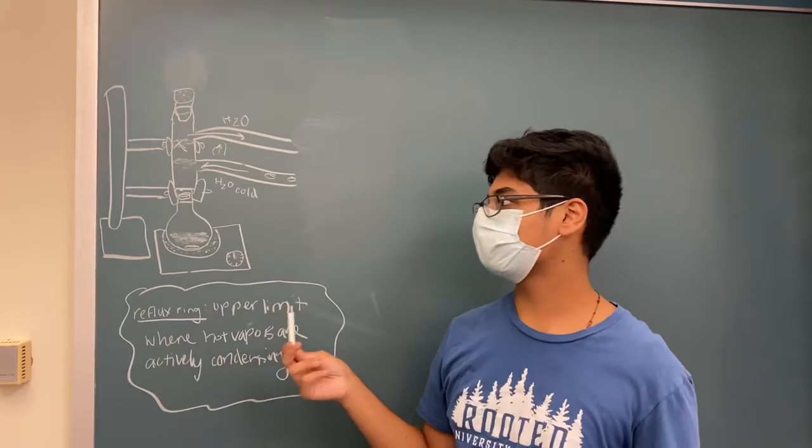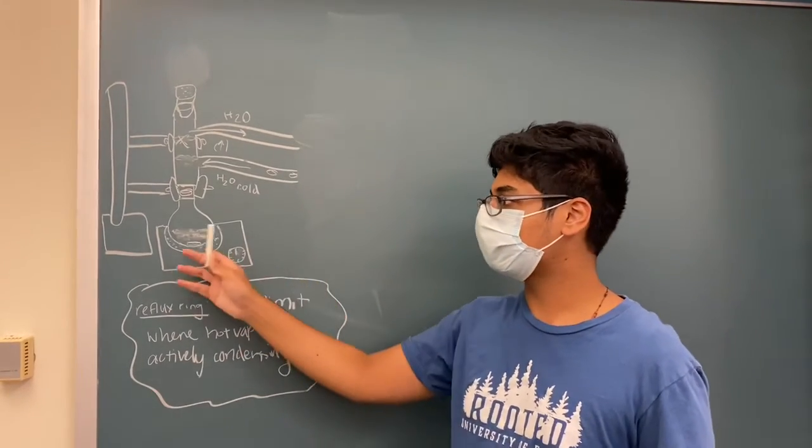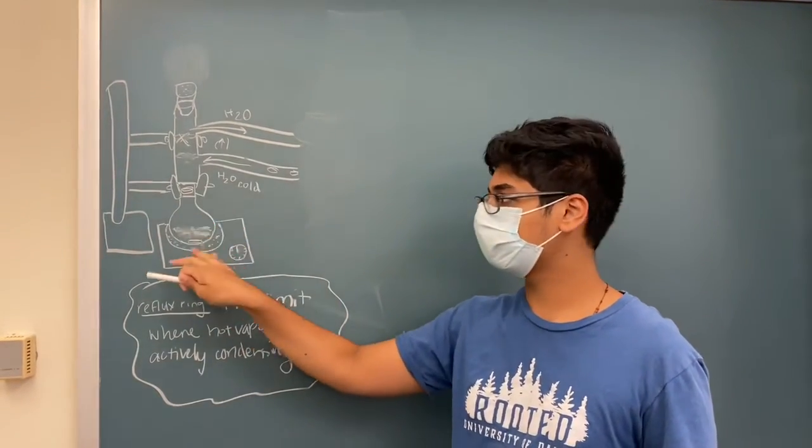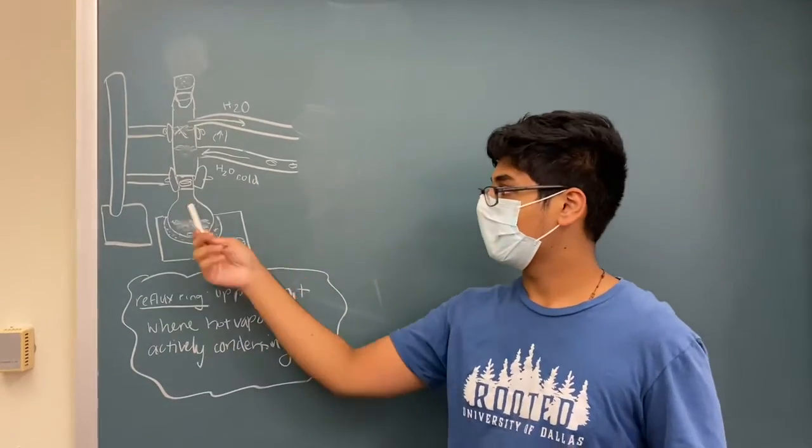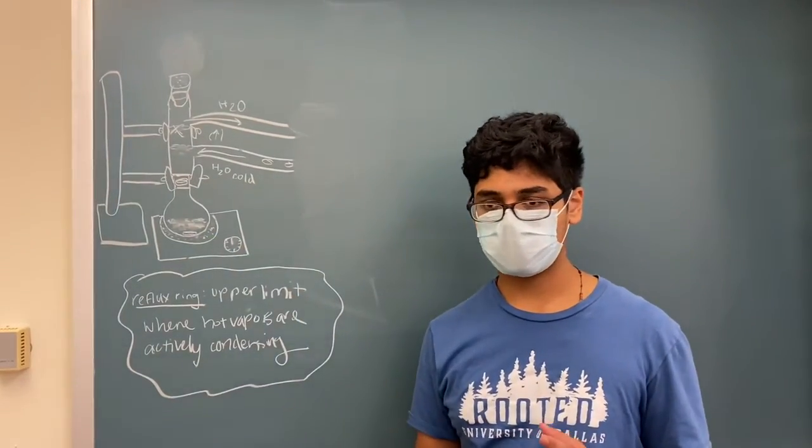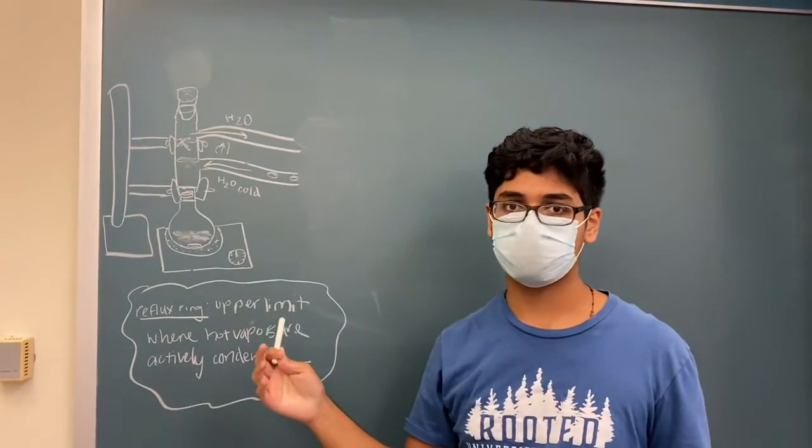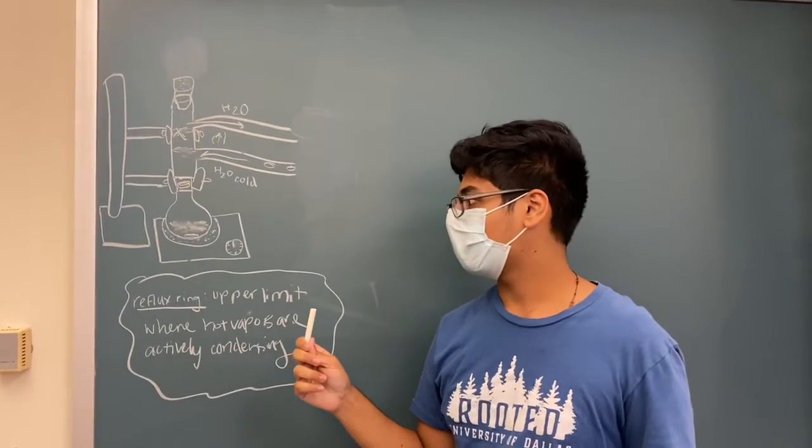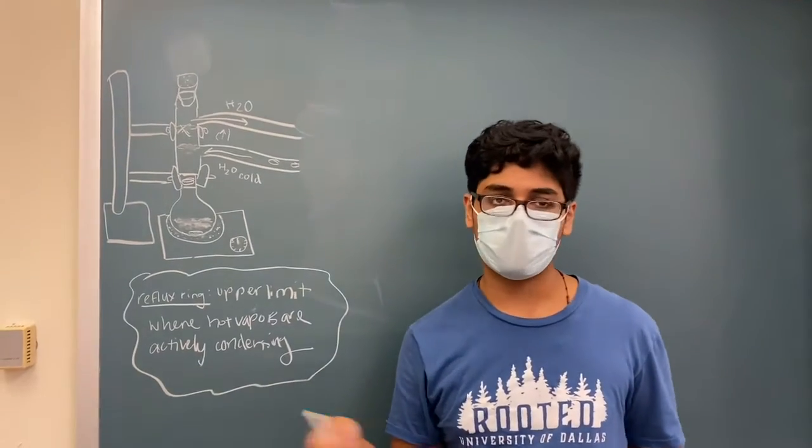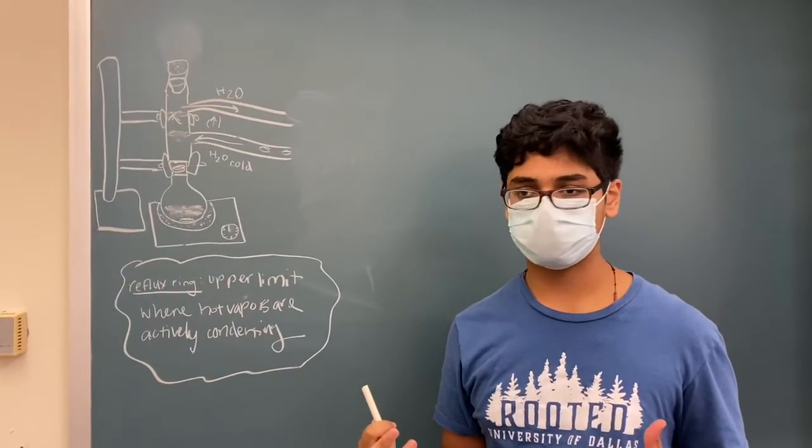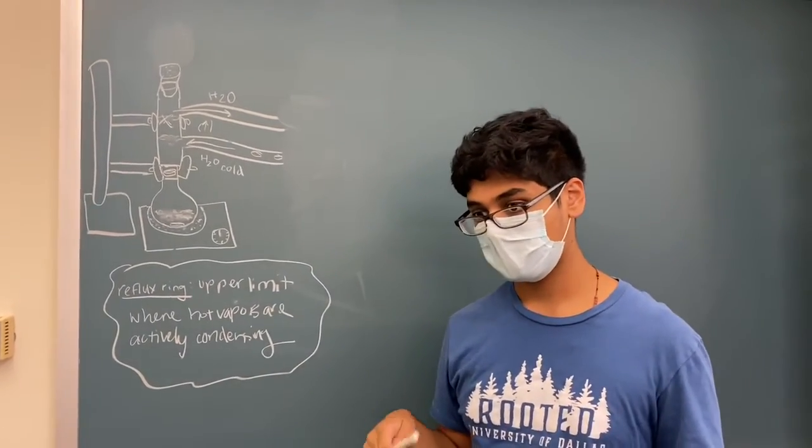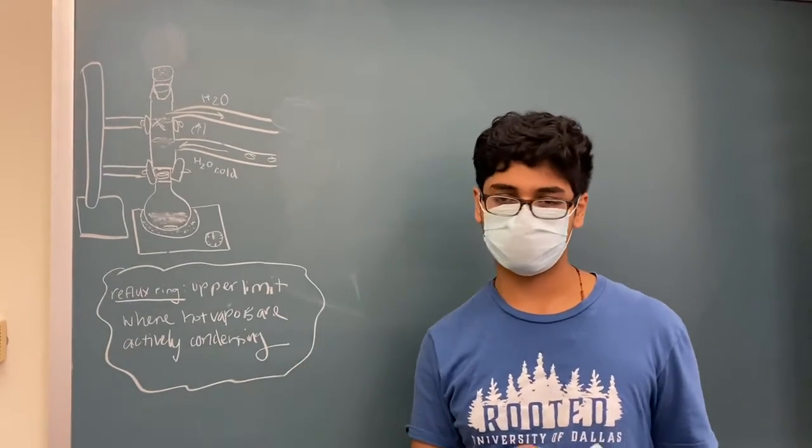Once it reaches that mark turn off the heat and try to raise the apparatus above the sand bath so that the round bottom flask can cool down and all the vapors traveling in and out can condense back into the solution. Afterwards, clean off all used materials and dispose of all materials in their proper designated locations.